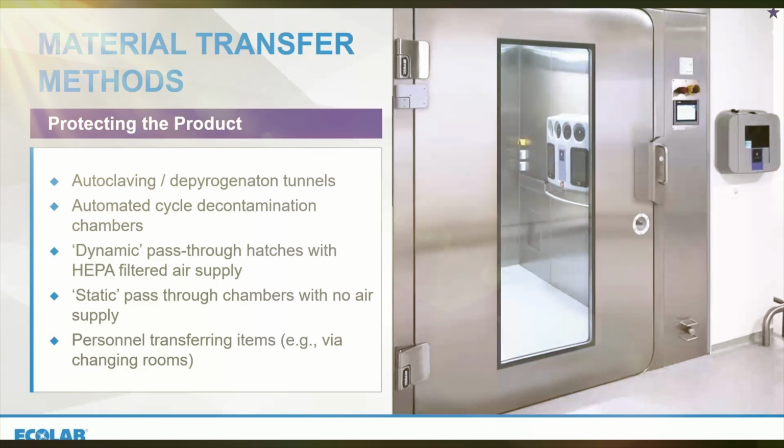But a number of items can't be autoclaved, and also there's a push within the pharmaceutical industry to use single-use sterile disposable items as well. These, and they're largely plastic items, would in some facilities with particular chambers, they might attempt an automated decontamination process, such as using hydrogen peroxide vapor.